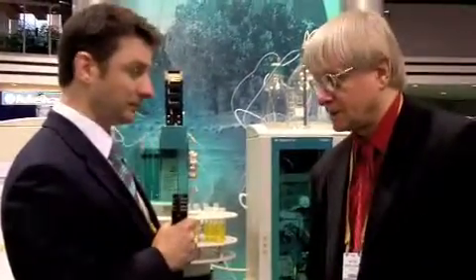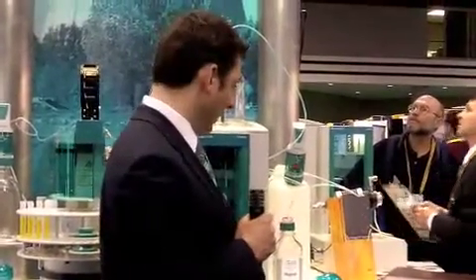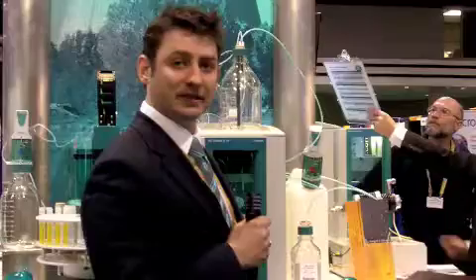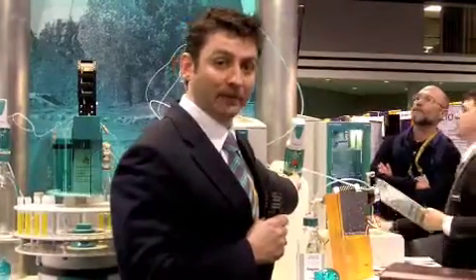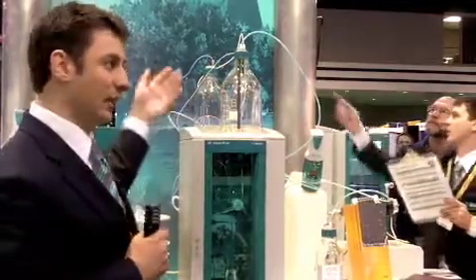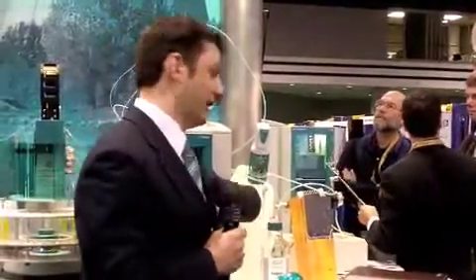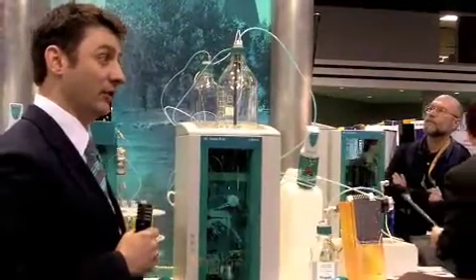Can you tell us a little bit about how it works? Absolutely. I'll start off with the eluent generation system, which we call EPOD. That stands for Eluent Preparation On Demand. Basically, we have a dosing unit which mechanically mixes a concentrate from this bottle with ultra-pure water from this tub here, which is then dispensed directly into the eluent bottle. An electronic sensing system detects when the eluent is being used, and as it's being consumed, it gets automatically prepared again. All you need to do is pour water into this bottle, and you can continuously run the system for about a month without having to prepare new eluent.